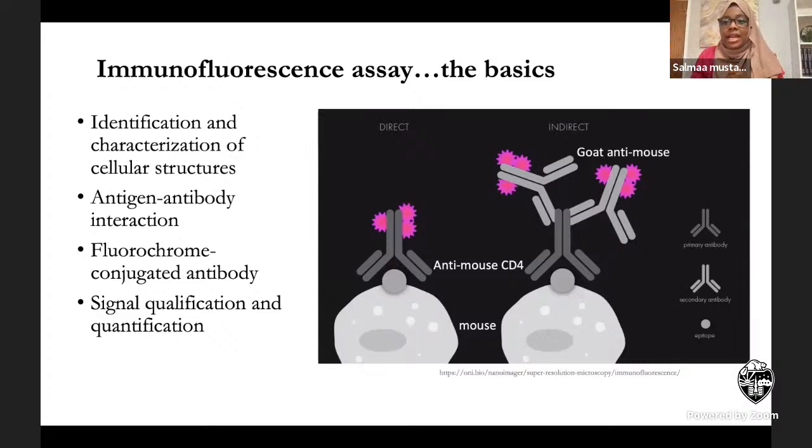Yes. That's why when I was using the slide, after plating the cells and before infecting, I would shake them to make sure they're all widespread before I put them in the incubator, because you want them spread so they can attach and keep growing. If you don't do that and just put the cells in the incubator, it could just be a clump of growing cells by the time you're ready. Does that make sense? Yes. Okay. Thank you.